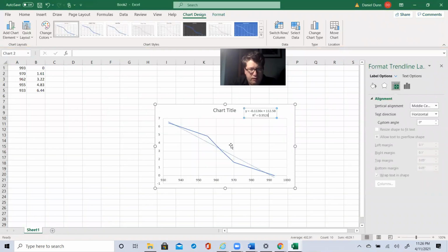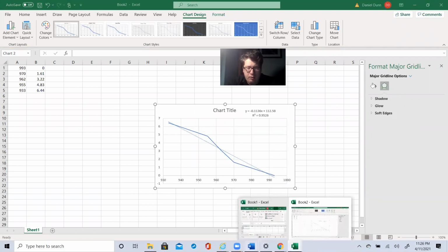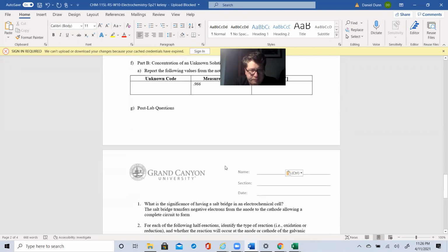Oops, I do apologize. I forgot to show you. You're going to take the graph. Make sure the graph has everything labeled in it. You guys have been doing good so far. Just make sure you know that the graph's going to go here.